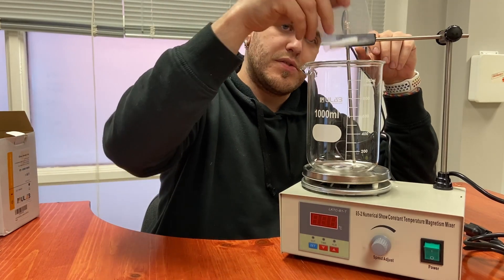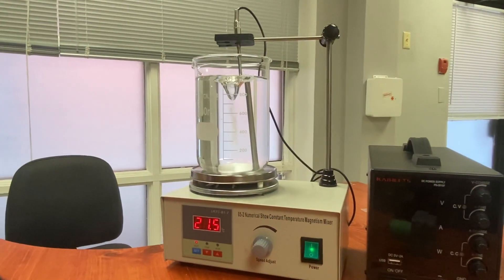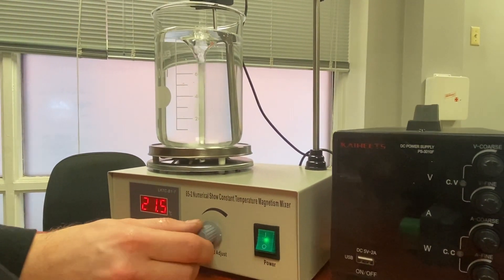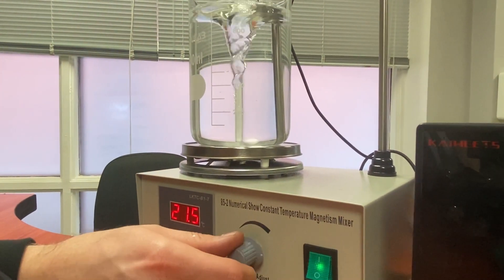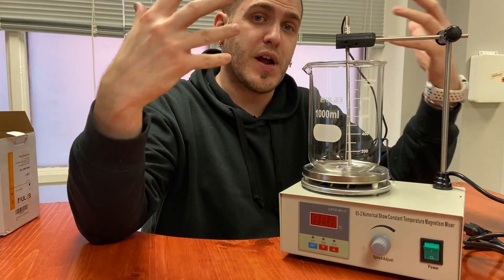It also has the little pill which kind of sits there — you can see it kind of grabbed onto that right away. There's a magnet inside that spins, and that's variable. You can go pretty fast and make a little whirlpool, or just light agitation. The probe also seems to have another holder thing here, so that'll be really useful for us.